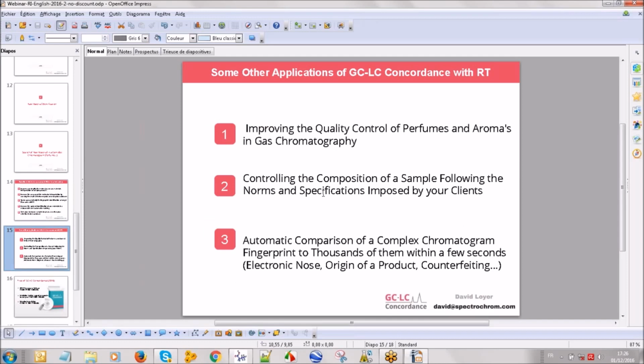If you've seen the webinar about the retention time, you know already, I invite you to watch it. You can improve the quality control of perfumes and aroma in gas chromatography, control the composition of samples following the norms and specifications imposed by your client, and do automatic comparison of complex chromatogram fingerprints to thousands of them within a few seconds. It's a new feature that doesn't exist apart from with GCLC Concordance with electronic nose. You can find the origin of a product, work on counterfeiting, and so on.